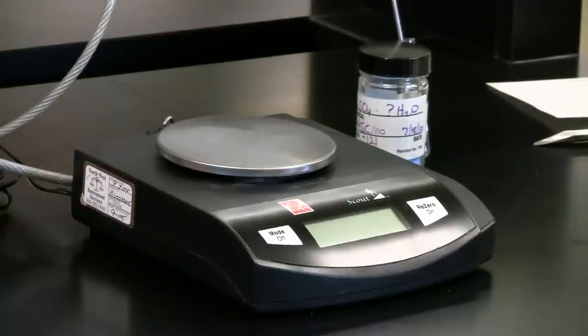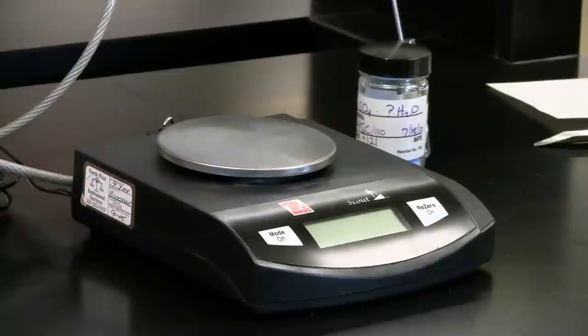In chemistry lab, you will need to measure the mass of samples. We have two types of electronic balances used for this purpose: analytical balances and top-loading balances.